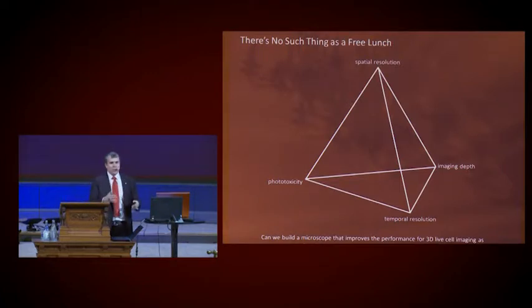Can we make a microscope that would be as much of an improvement over existing live imaging tools in terms of its performance for temporal resolution and non-invasiveness as the STED and PALM and so forth have been an improvement for spatial resolution? So when I got bored in 2008 of super resolution, that's the goal I set for myself.